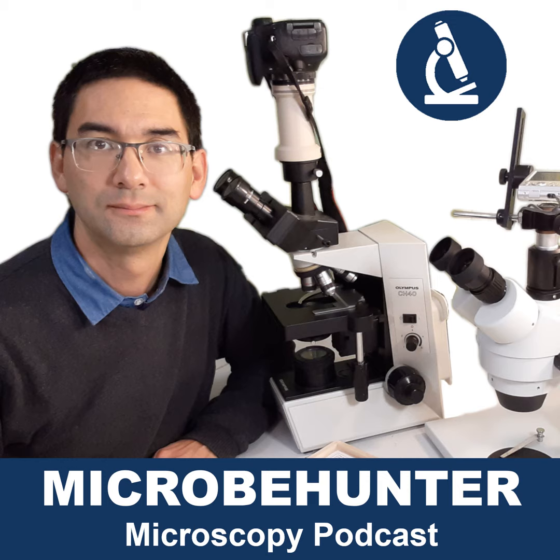These are mistakes I've seen quite often students make, and of course also other beginning microscopists. Some of them seem to be quite common sense problems that you should avoid, but if you're not consciously aware of them, then you might easily overlook them.